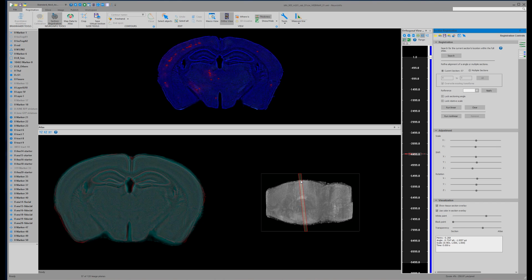So one thing we can do is test how good that offset is in other areas. So I'm going to go rostral and see. These are the offsets. I'll go rostral.